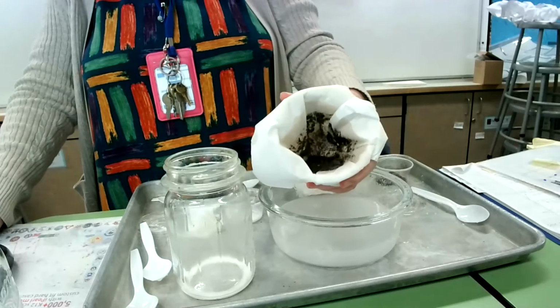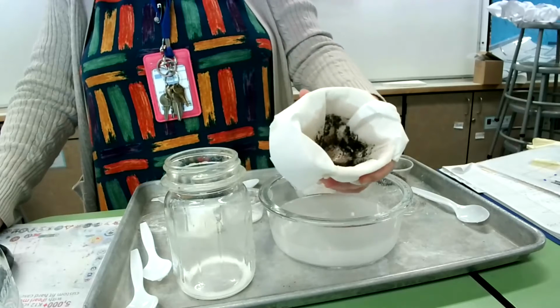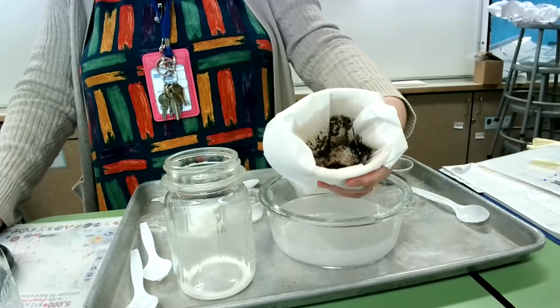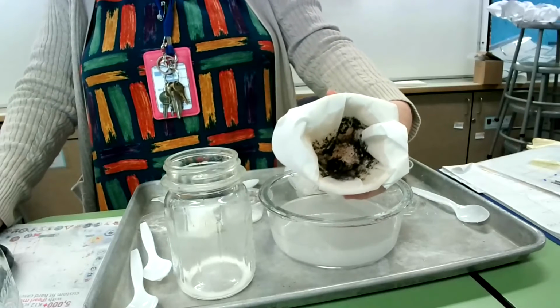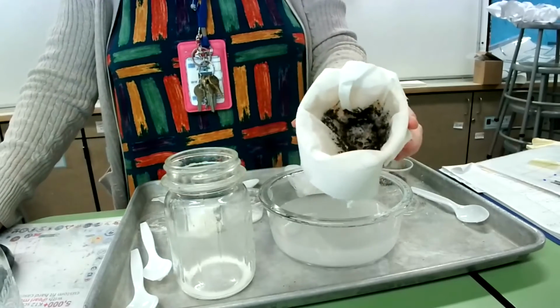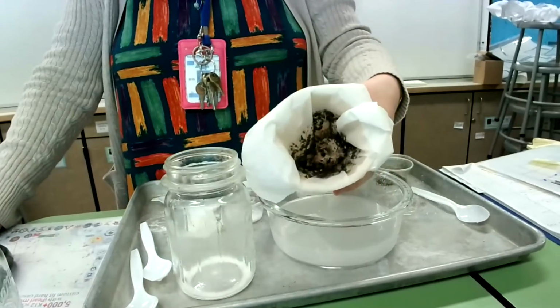But my filter is catching the soil and the sand particles. So if you filter a mixture, and you get stuff left on the filter, that means it was not a solution, it was a mixture, okay? So the soil didn't actually dissolve in the water, and the sand didn't dissolve in the water, it just mixed with it. So we were able to filter it out.